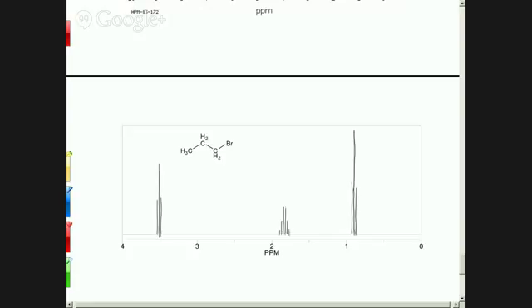All right, so that's what this one looks like. This is 1-bromopropane. Let's look just at the splitting pattern and the shielding and deshielding, the shift, called the chemical shift, and see if we can figure this out without even looking at the integrations. The integrations often are our best clue to what this is, but we're going to leave them off for now. So what can you tell me about any of those peaks, anything that you see at all?